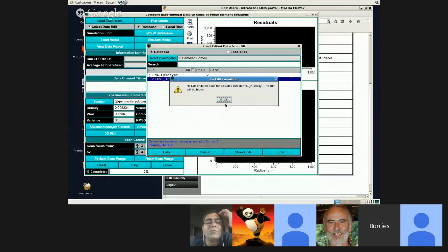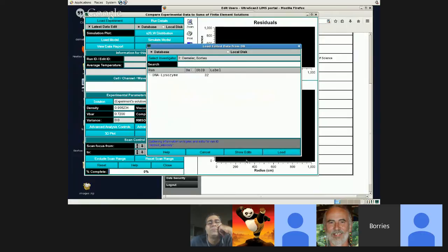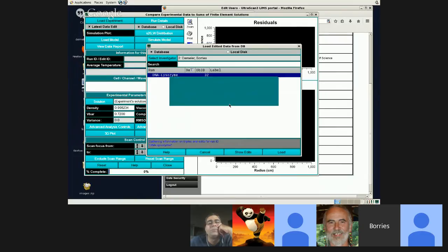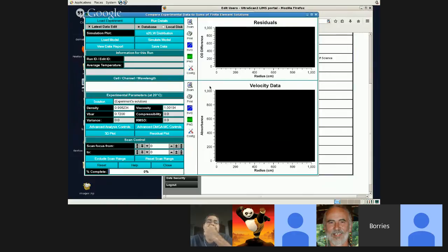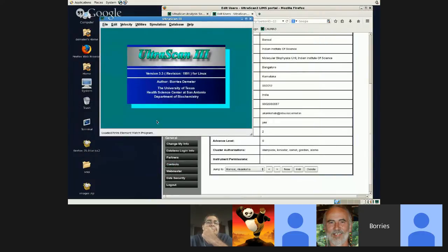Now it says no edit children exist for selected run demo 1 intensity. The run will be hidden. This is on FEMatch when I'm trying to load data from the IISC database under my name. So that's not working right now. So I apologize that we can't get any further here.